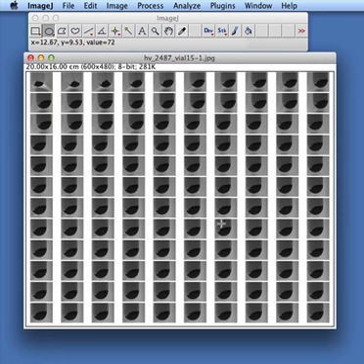So now I have a scale, so every pixel has a length to it, and I can use that information when I go through the processing to do not only pixel counting to get areas or the cross-sectional area of this particle over time, but I can also do various manipulations to look at size and shape factors as well. So now I have a grayscale image. We have a set calibration. I'm just going to extract out the information I'm interested in.